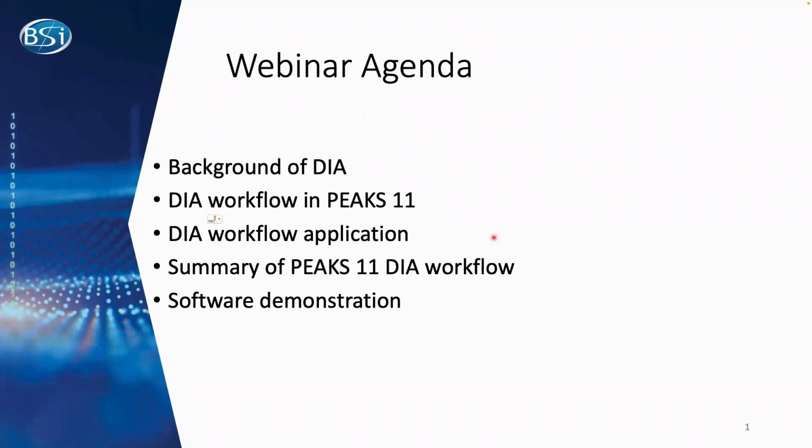First we'll begin with the webinar agenda. First, we'll be looking at the background of DIA. Afterwards, I'll discuss the DIA workflow in PEAKS 11. Next, I'll cover DIA workflow application using 2 cases. And then I will follow up with a summary of the PEAKS 11 DIA workflow. Following the summary, I will do the software demonstration.